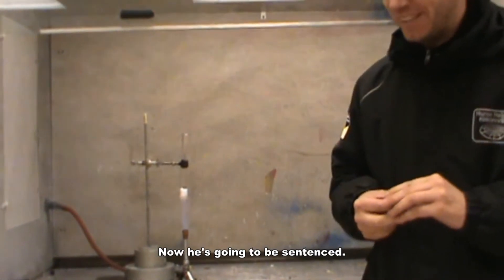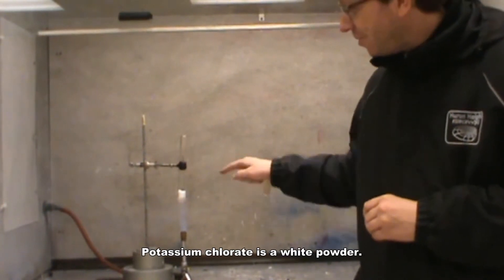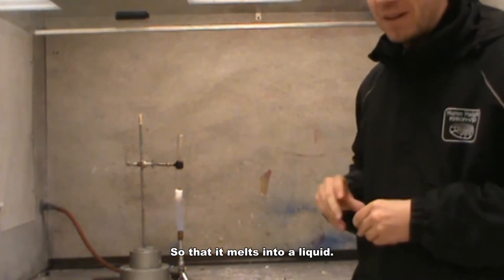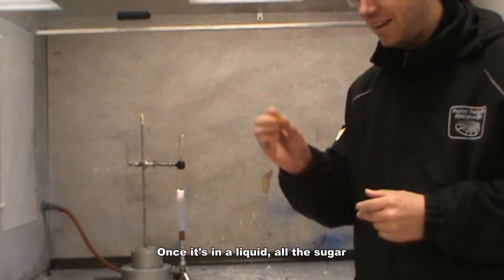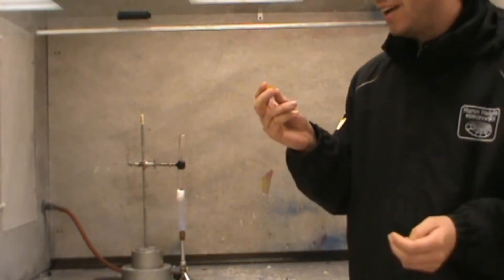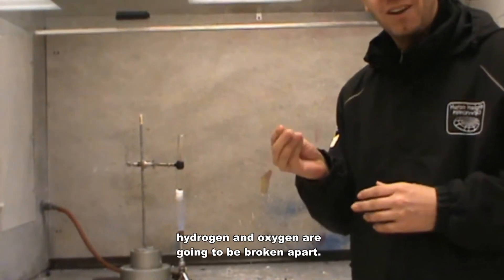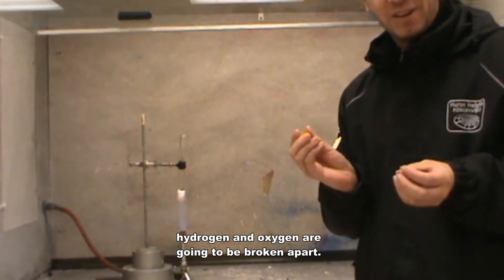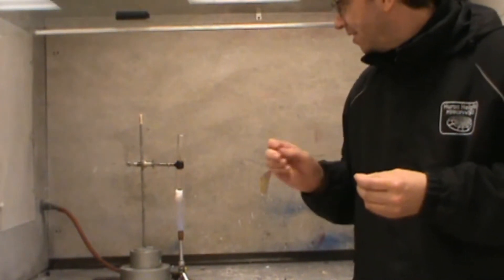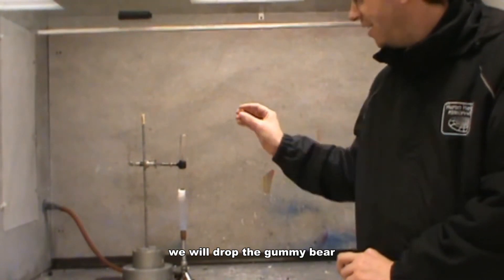Now he's going to be sentenced. What I have here is potassium chlorate — potassium chlorate is a white powder. You can see I have the Bunsen burner heating it up so that it melts into a liquid. Once it's in a liquid, all the sugar in this gummy bear — and it's pretty much sugar — all the bonds between the carbon, hydrogen, and oxygen are going to be broken apart, and that's going to release a lot of stored potential energy.